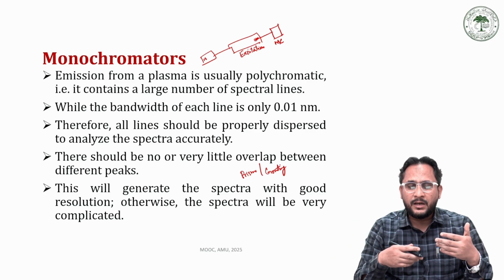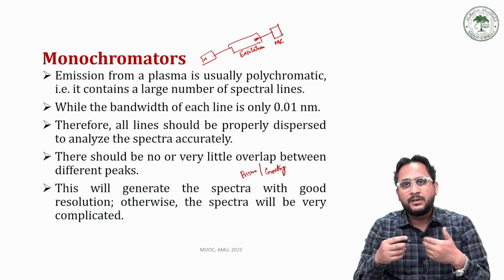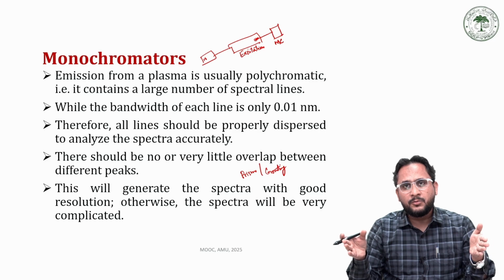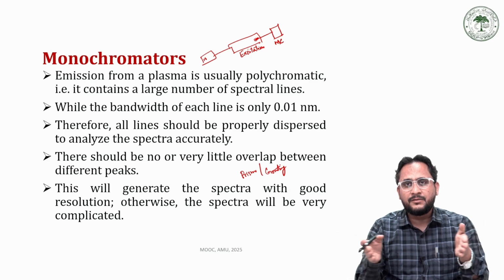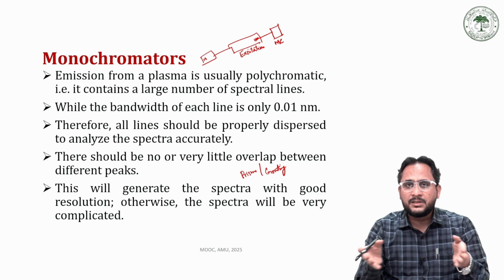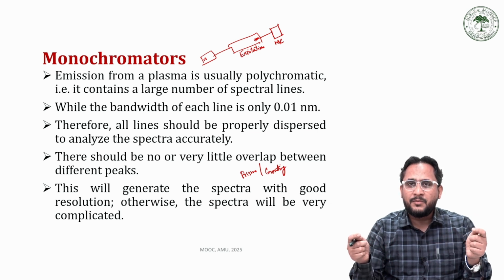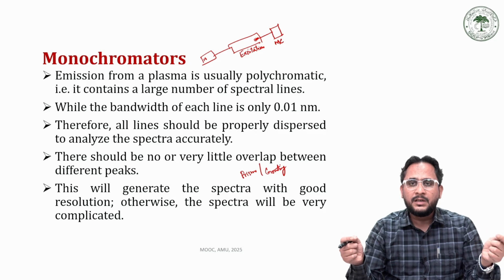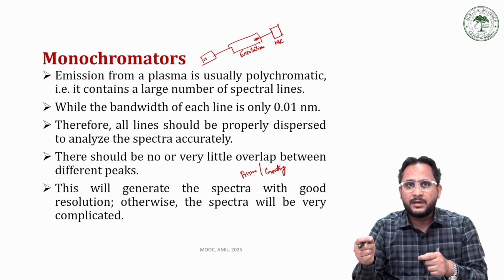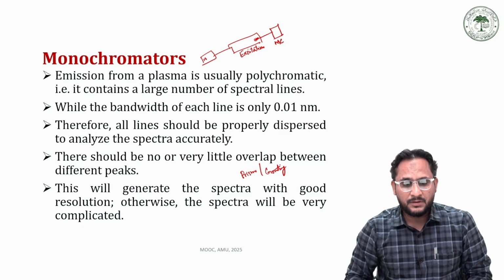And if we want to have a more specific wavelength, we may use a prism and grating together. First, a 200 nanometer wide light radiation is converted into 50 nanometer, and then the prism or grating is used again, which converts this 50 nanometer again into 10 nanometer. So we can bring down the wide gap of this electromagnetic radiation of 200 and make it very narrow. We bring it down to 10 nanometer. So for this purpose, monochromators are used.